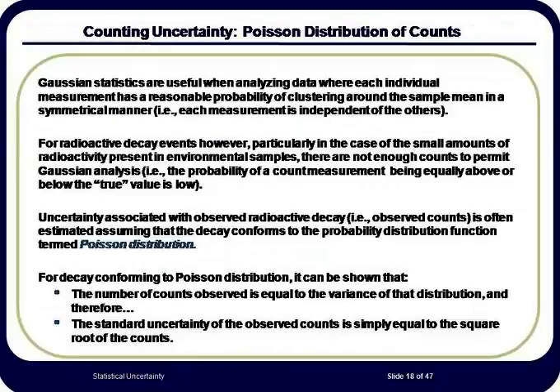Measurements made with traditional analytical instrumentation usually fall into the realm of Gaussian statistics with respect to the uncertainty of the measurement. This is because there is an equal probability of a measured value falling on either side of the true mean value. This is not the case with radiochemical counting at low levels.